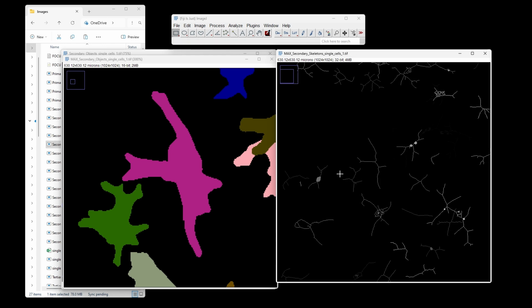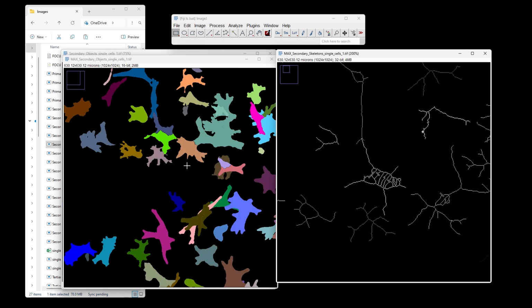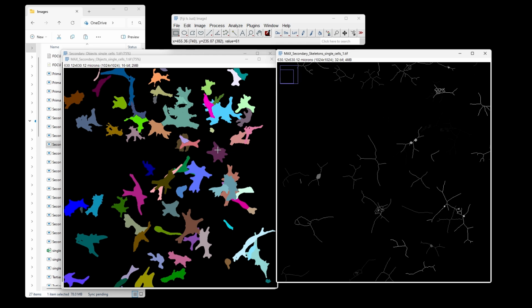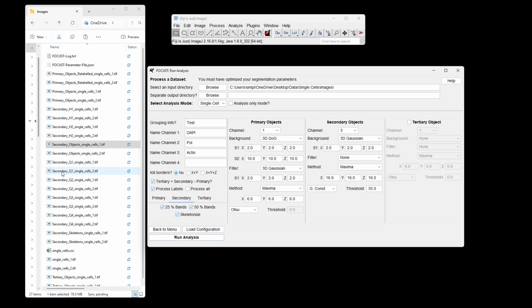And of course, if they're imperfect shapes, or there are holes in those shapes, or there are problems with segmentation, absolutely the skeletons will be a bit rubbish. But the potential for extracting some really cool data here is very high. So we have some skeletons, that's cool. Let's have a look at some quartiles.